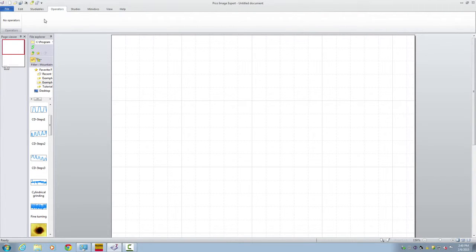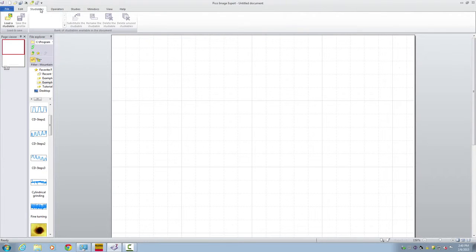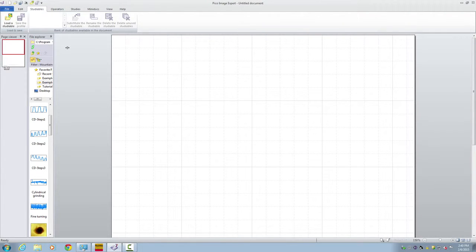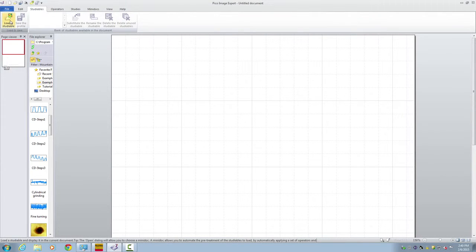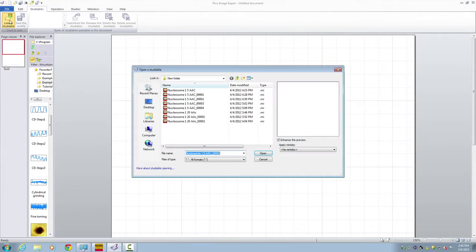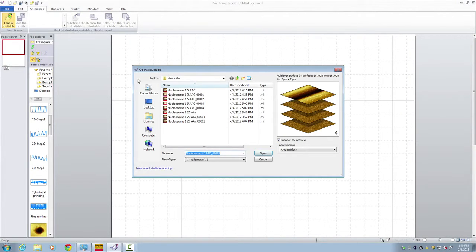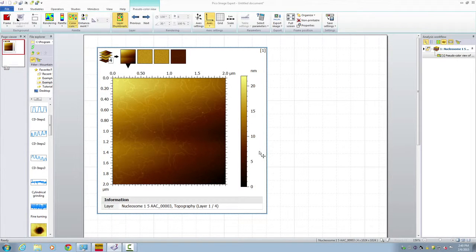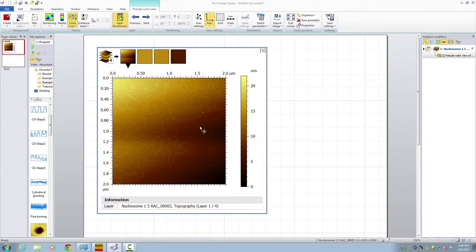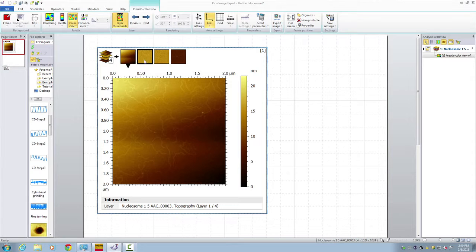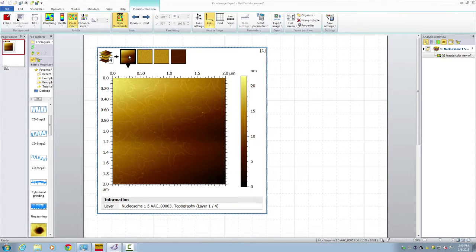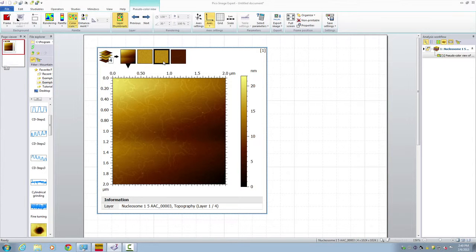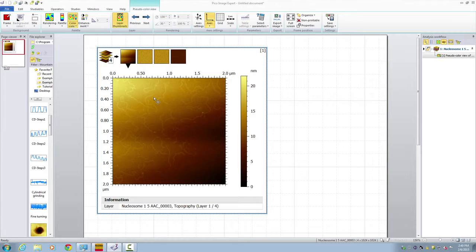In the headline we could choose the tag that says studyable. Here we use the name studyable to describe an AFM file. Let's load a studyable. Now this studyable file has four pages. The first page is topography and second and third are amplitude and phase. We're going to only introduce the processing of topography.